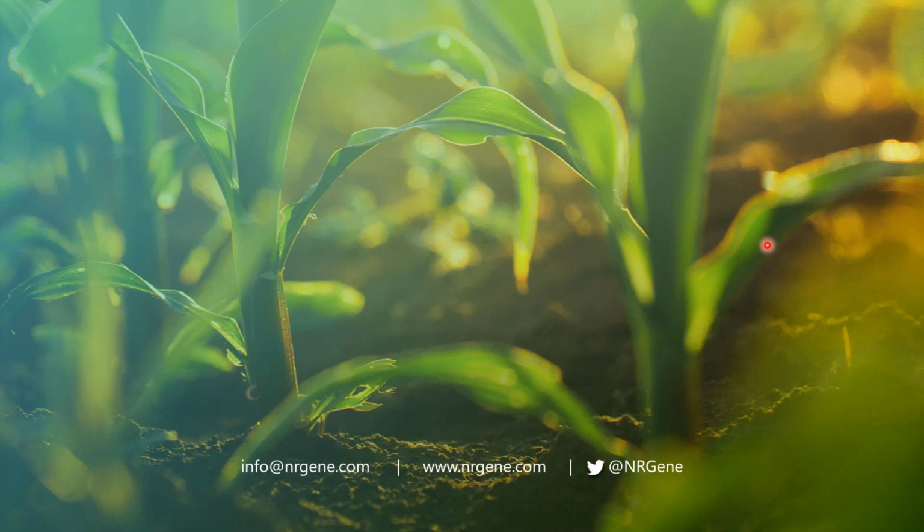Okay, thank you for that question. So I would say that the best time is when you already have, for example, in the application of genomic selection, your training population and phenotype data, and you are on your way to actually applying genotyping at a large scale. Up until that stage, you may have been able to afford using higher density information on that population, because there weren't a lot of samples at that stage. But when you want to really upscale, you would benefit from the application of SNPer. But obviously there are other use cases. SNPer can also be used to design smaller panels for marker-assisted backcross and other applications. So I was just referring to one.